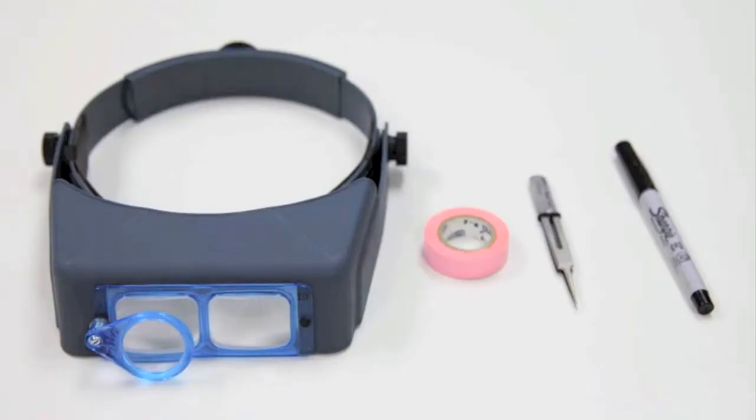During the next part of this module, you'll be performing a real genetic cross between the wild type Columbia and GL1 mutant plants. For these crosses, you will need your Optivisor, a pair of tweezers, some tape, and a marker.